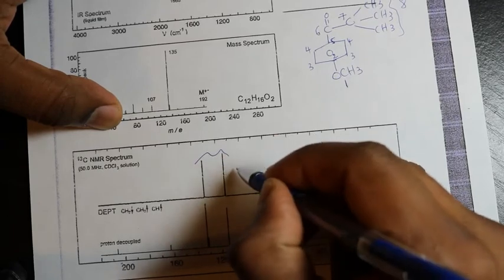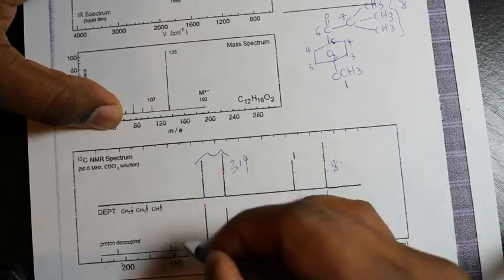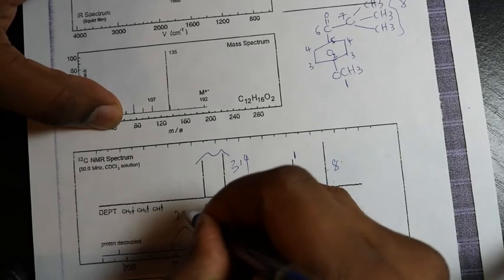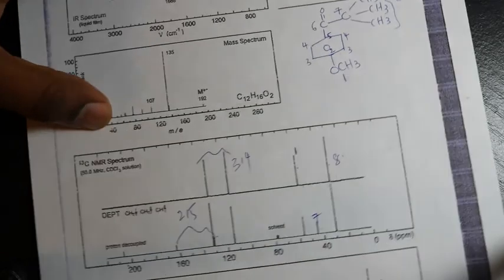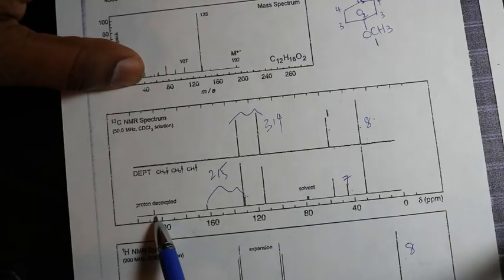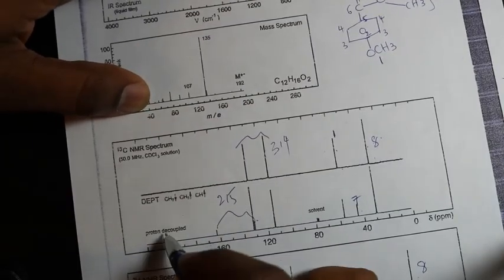These 2 are 3 and 4, so the tiny ones are 2 and 5, and this tiny peak here is carbon 6.